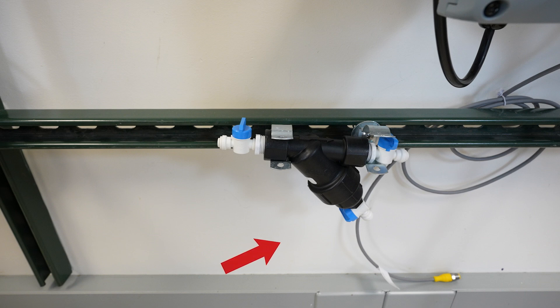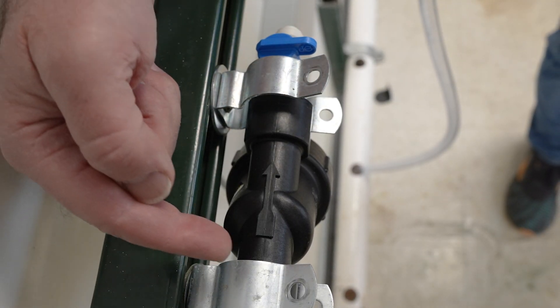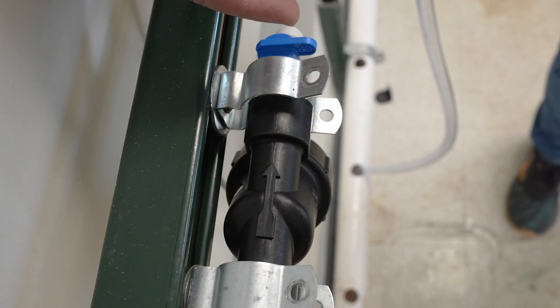When you install the Y-strainer on the wall, make sure that the angled bypass port points down. Make sure that the flow arrow on the Y-strainer points toward the analyzer.